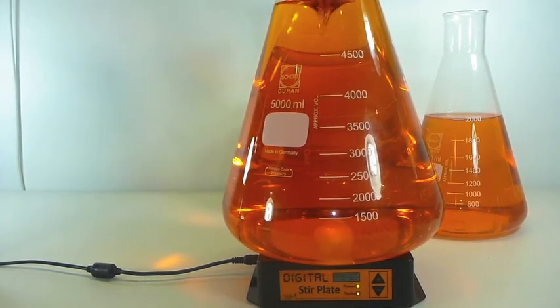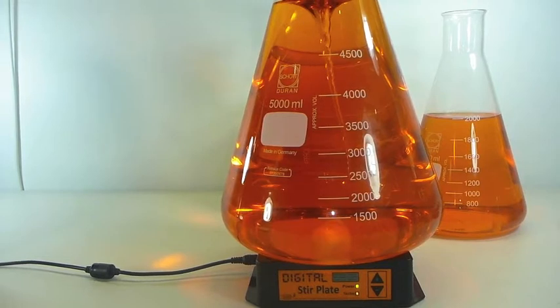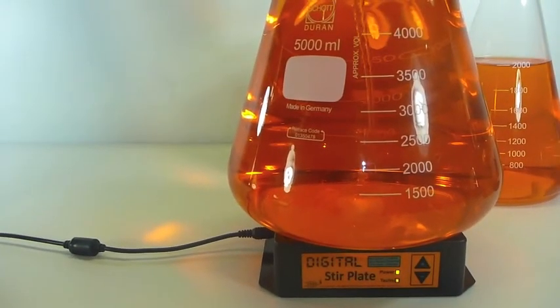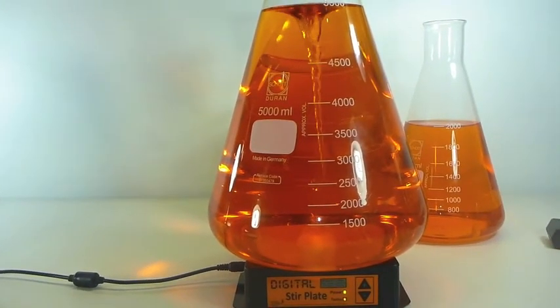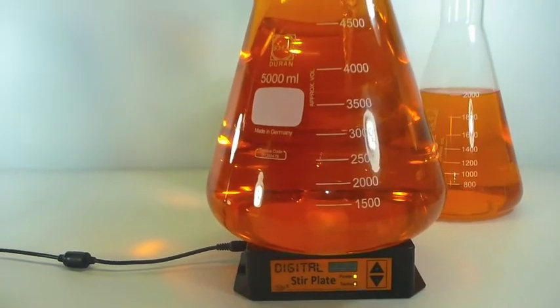Now there's no reason the digital stir plate is just for brewers. At the end of the day, the extra controllability could have a myriad of applications in controlled scientific experiments. In fact, I have a few experiments I'd like to carry out myself in the near future and I'll be putting them up on YouTube as well. So if you do use our stir plates in a lab environment, send us a line and we'd love to hear how it's working out for you.